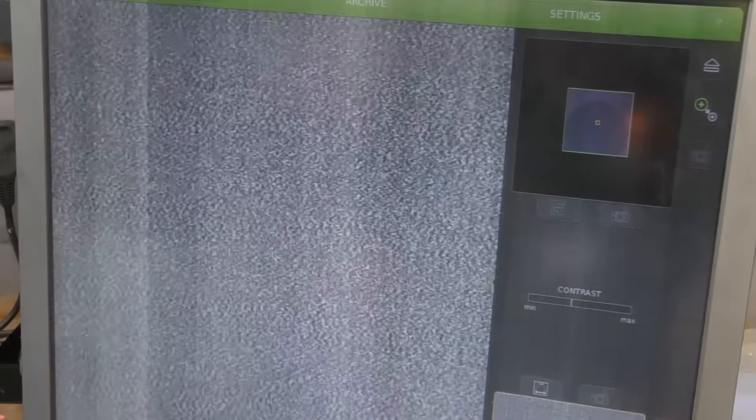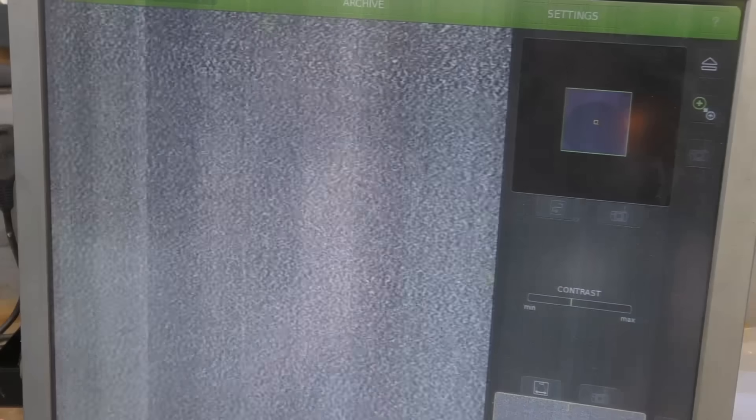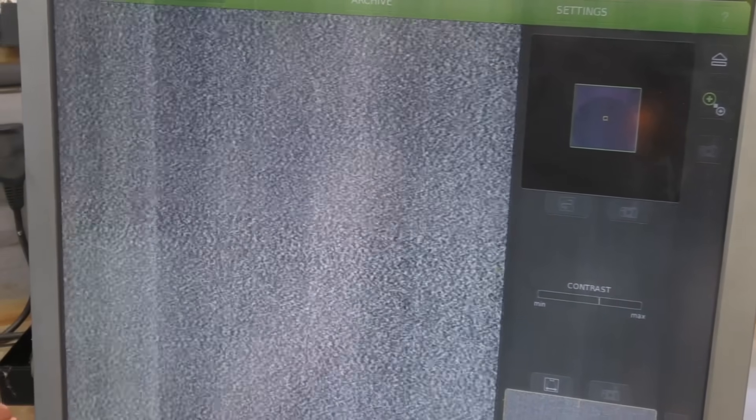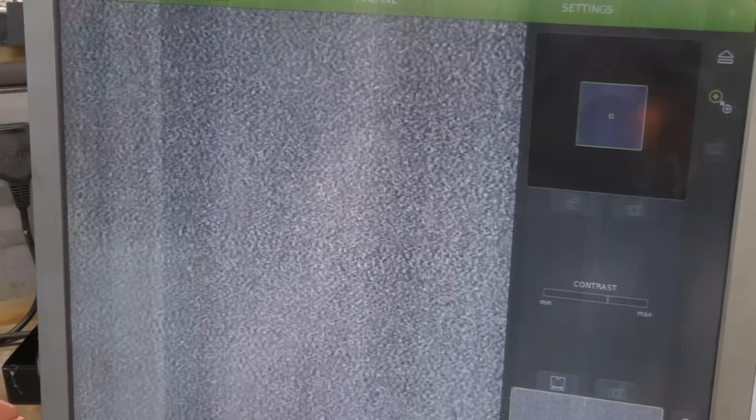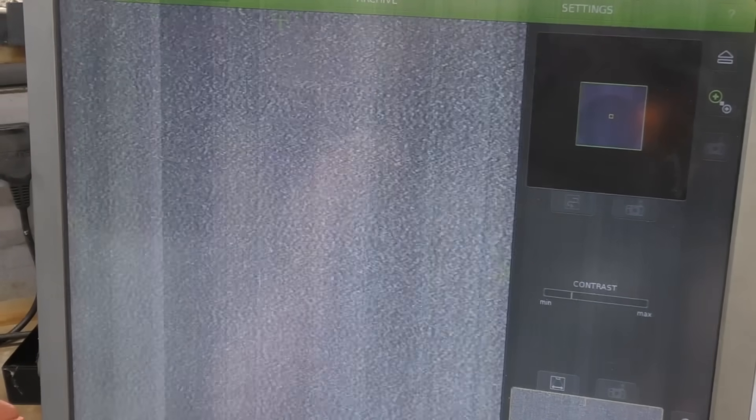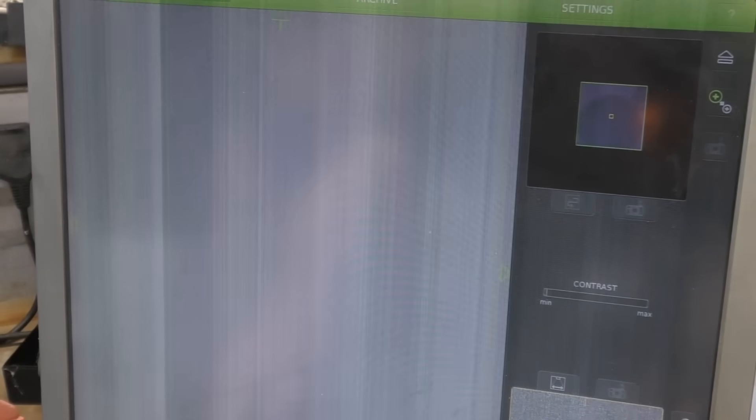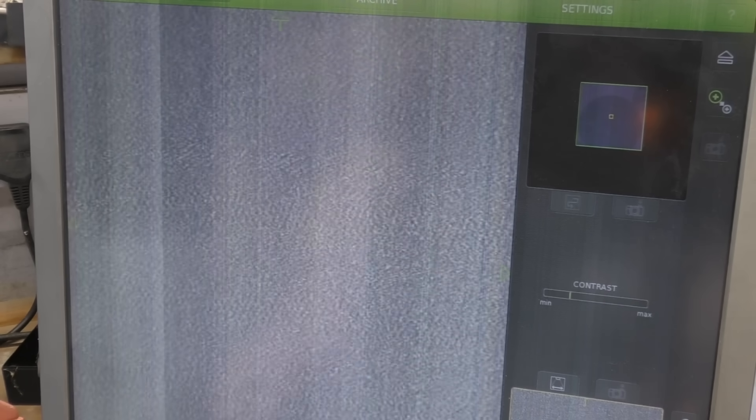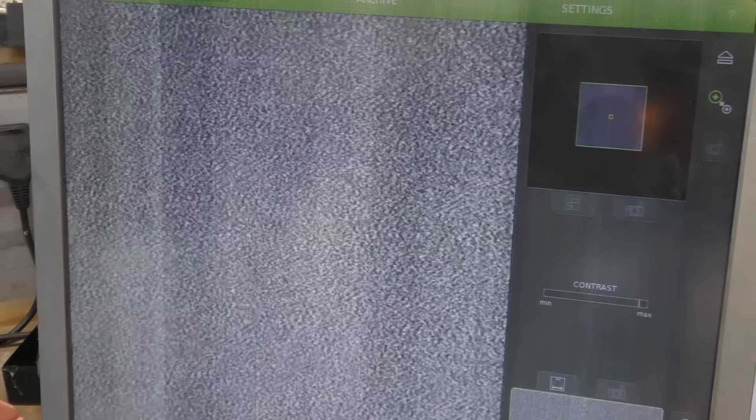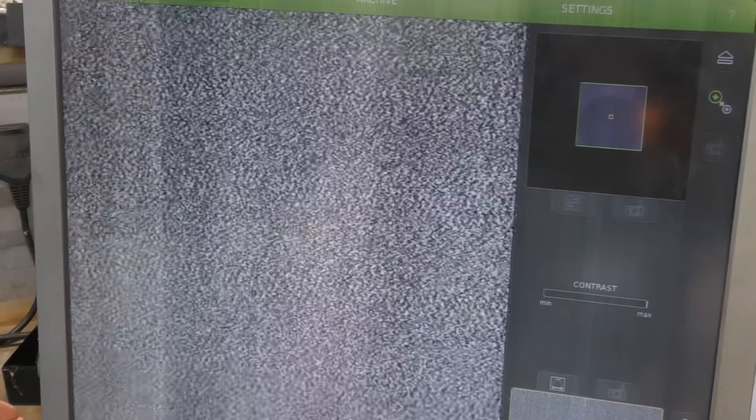Certainly these vertical lines on the monitor, that's just the monitor. The backlight is in a very rough state. We're getting no structured information at all out of the detector. The only thing I can do that makes any difference visually is adjusting the contrast. That is clearly just adjusting the gain. So here we go from nothing to just amplifying noise from a lack of signal.